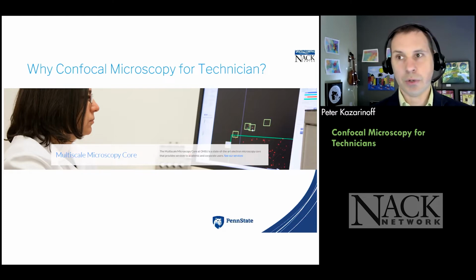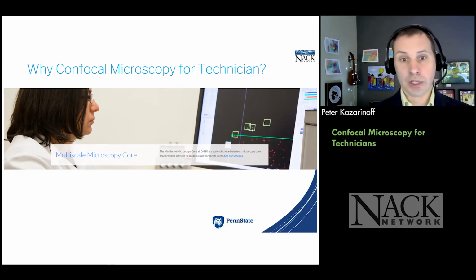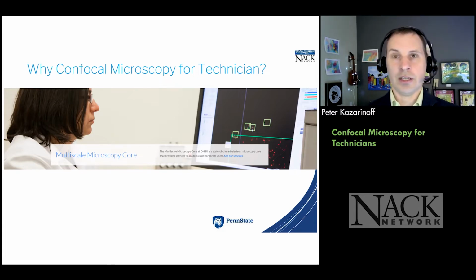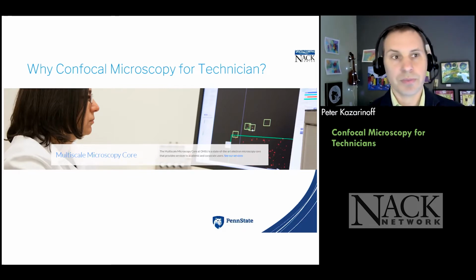Here in Portland, for instance, at Oregon Health Sciences University, their imaging center has SEMs and TEMs, but also has a lot of state-of-the-art laser scanning confocal microscopes. And so if we give technicians that confocal training, they've got one extra thing on their resume that will set them apart from other candidates who want to work in those microscopy facilities.